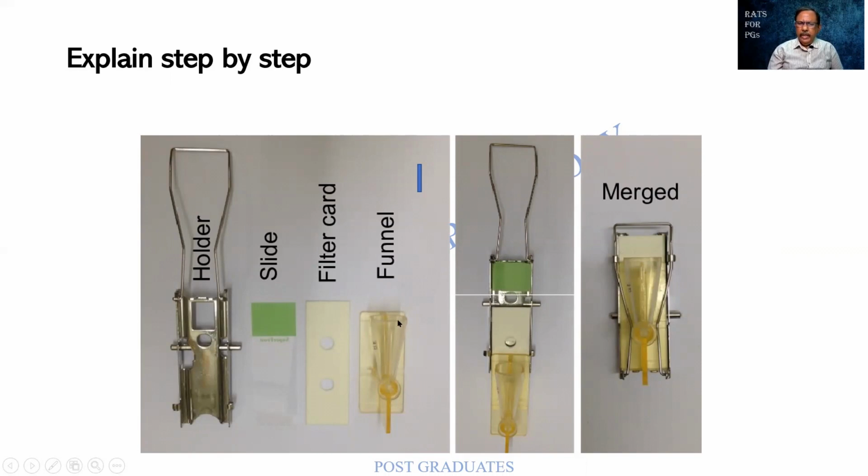I find a Y-shaped material that is actually a funnel. The fluid is poured into it, and once the centrifuge is switched on, there is a deposit of the material which will be transmitted through this hole onto the slide. Also the filter paper absorbs all the unwanted material.